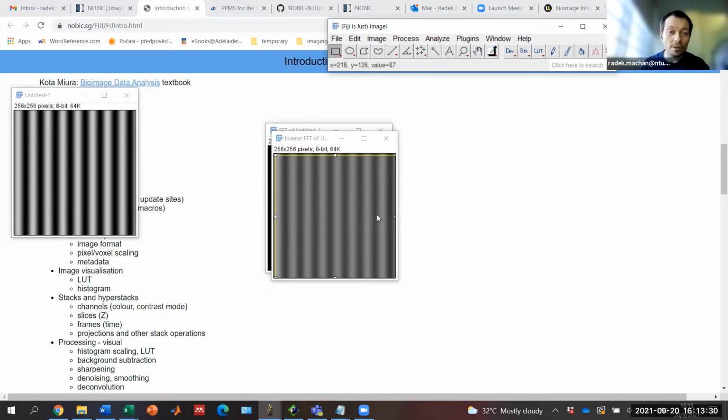So this is something which is actually happening in optical systems. And you probably heard many times about resolution of optical microscopes, about the diffraction limit. And you know the description of this phenomenon in spatial domain, where there is some point spread function. So if you image an infinitely small object, a single point, the image won't be a single point, it will be broader. It will be a point spread function of the microscope. And then if you image an arbitrary object, the image will be a convolution of the object with the point spread function.